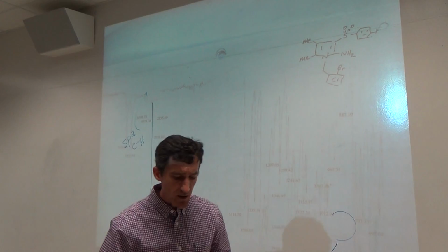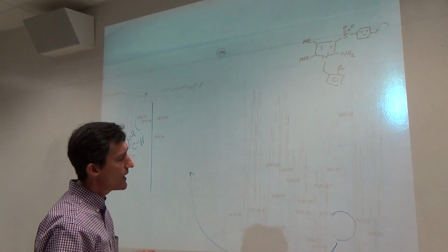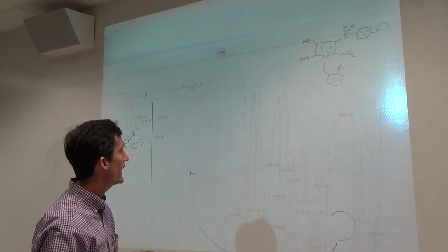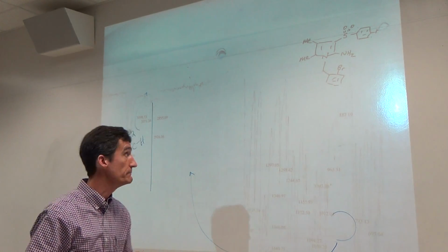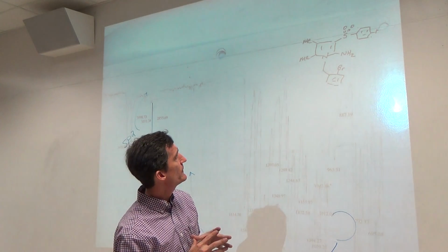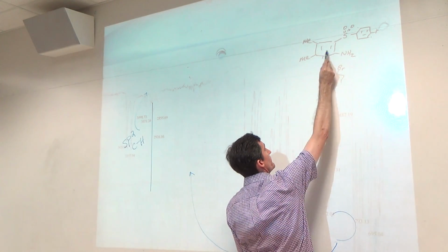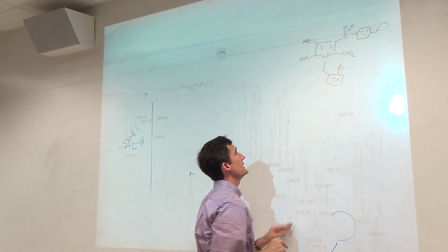Okay, this is not showing up entirely well here. The copy was not good for some reason. But I'm going to end this second video by showing you some IRs from the research lab. It got hole punched there, but this is a compound made by one of my research students. It's a pyrrole aromatic with the nitrogen here. Main thing, let's look at the NH2, the amine.